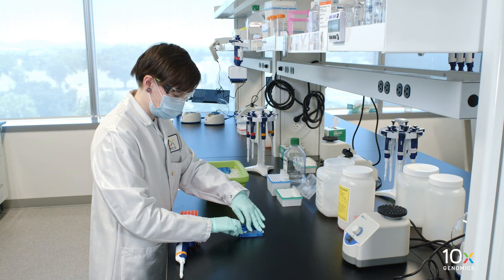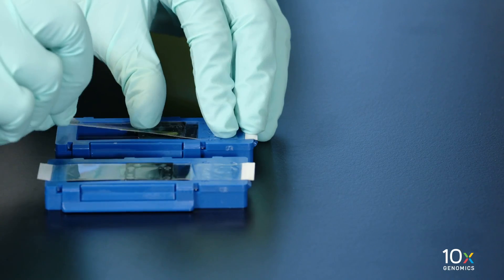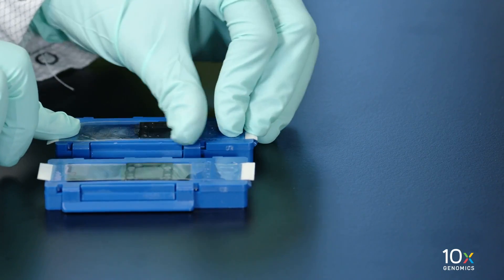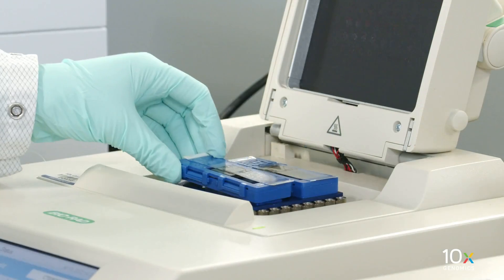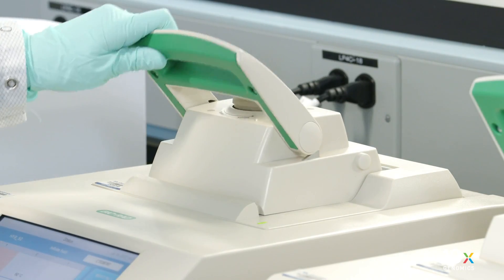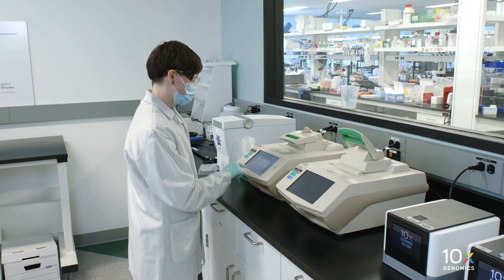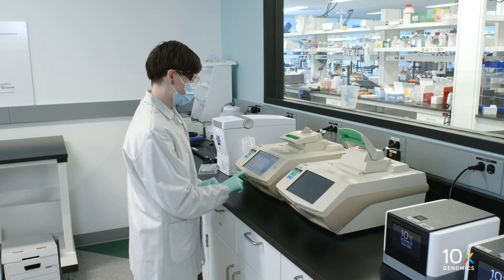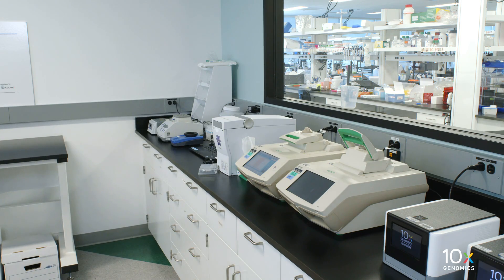Reapply the Visium Slide Seal on the Tissue Slide Cassette. Place the cassette on the low profile thermocycler adapter on the preheated thermal cycler. Close the thermal cycler lid. Skip the hybridization step and initiate the post hybridization wash. Incubate in the thermal cycler at 50 degrees Celsius for 5 minutes.